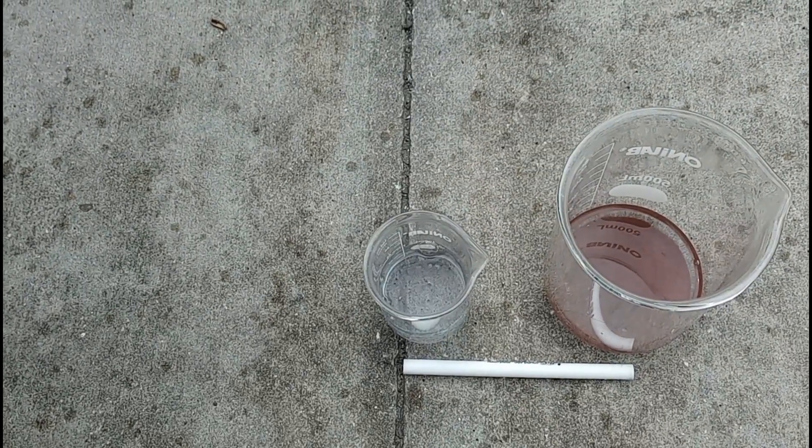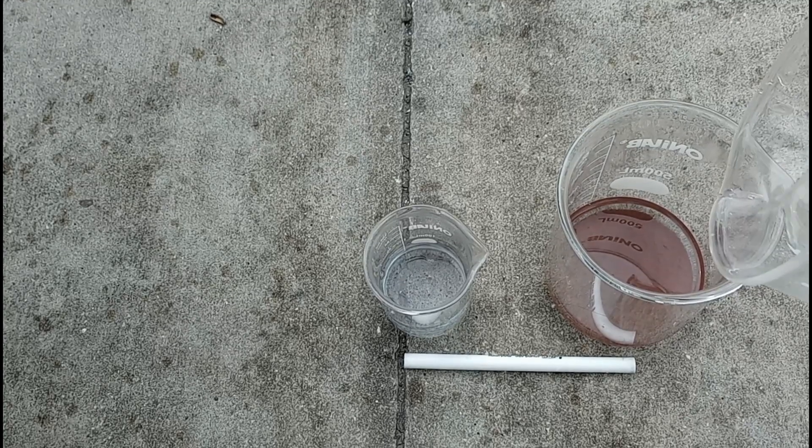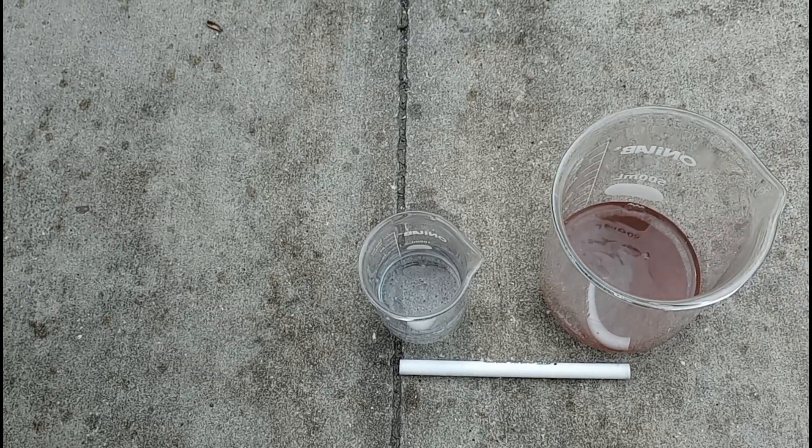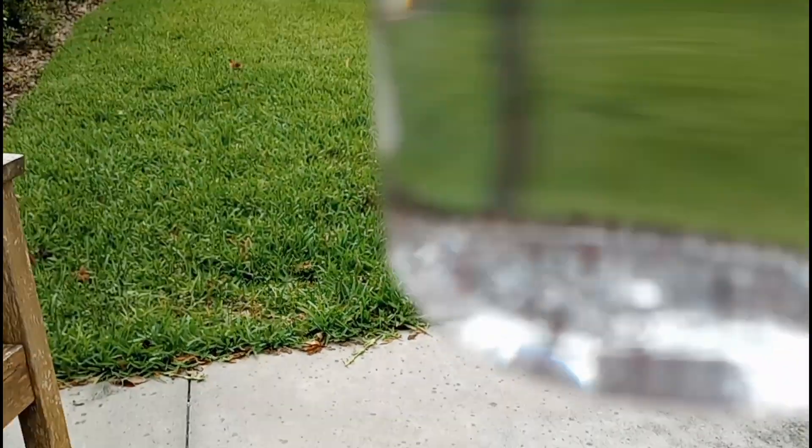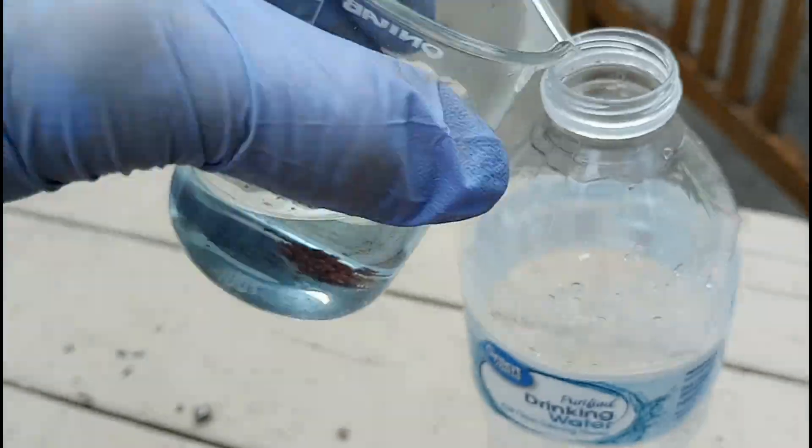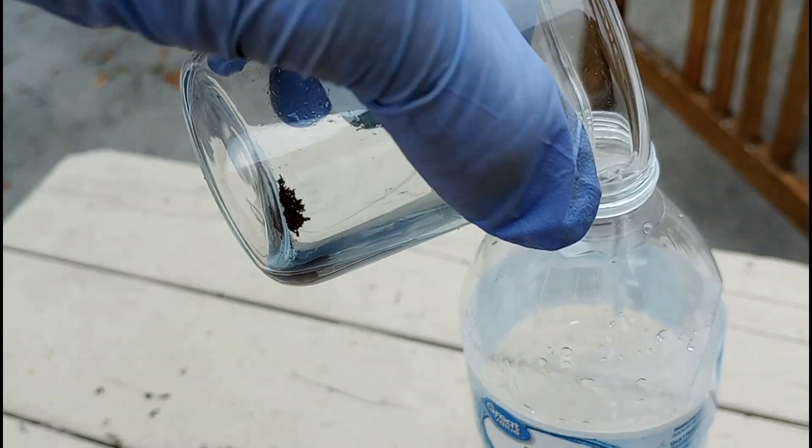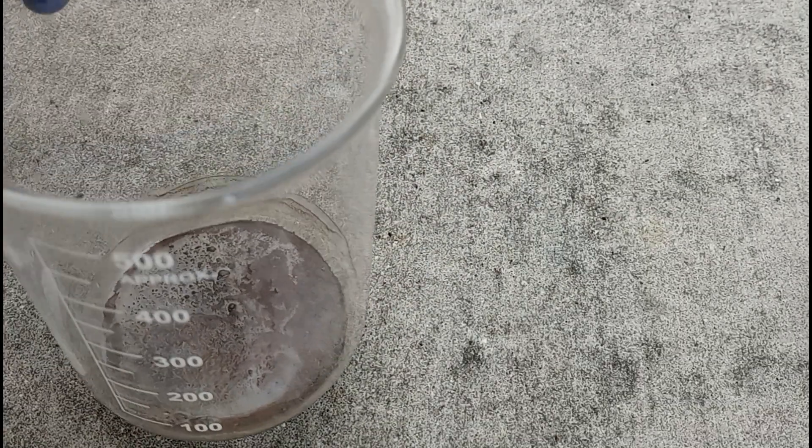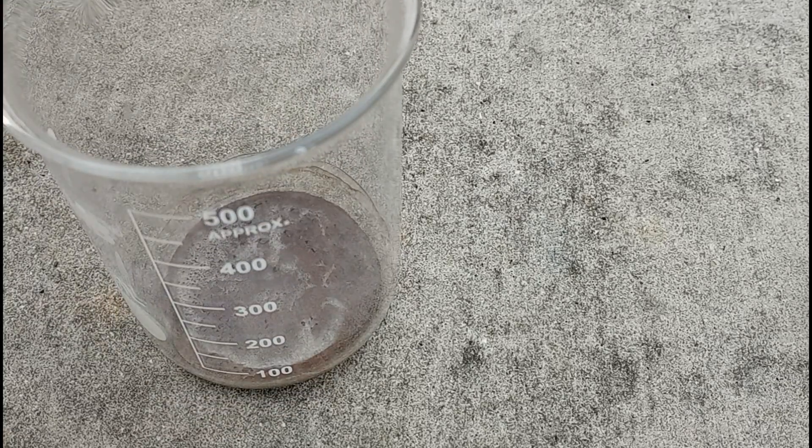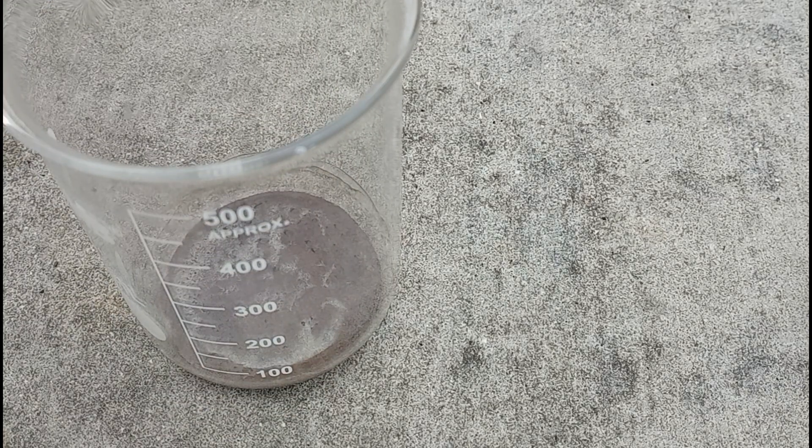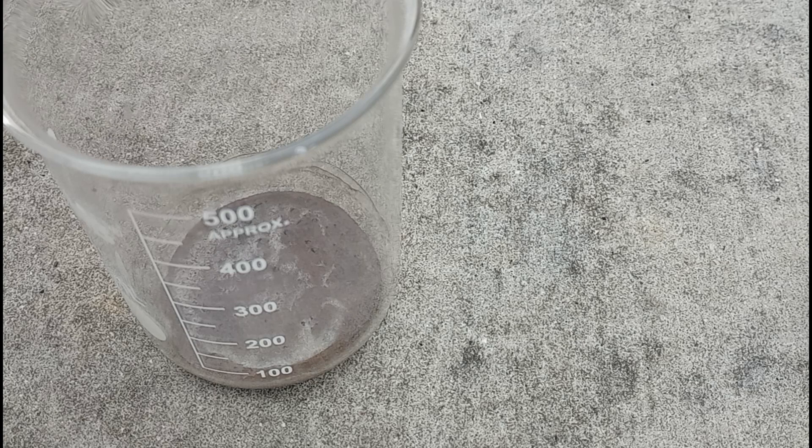I added some distilled water and combined both of the liquids and both of the solids. I put all of the liquid into this water bottle for storage. Now that I had all the solids together, it still looked like there were some black flakes, so I decided to turn this into copper chloride.